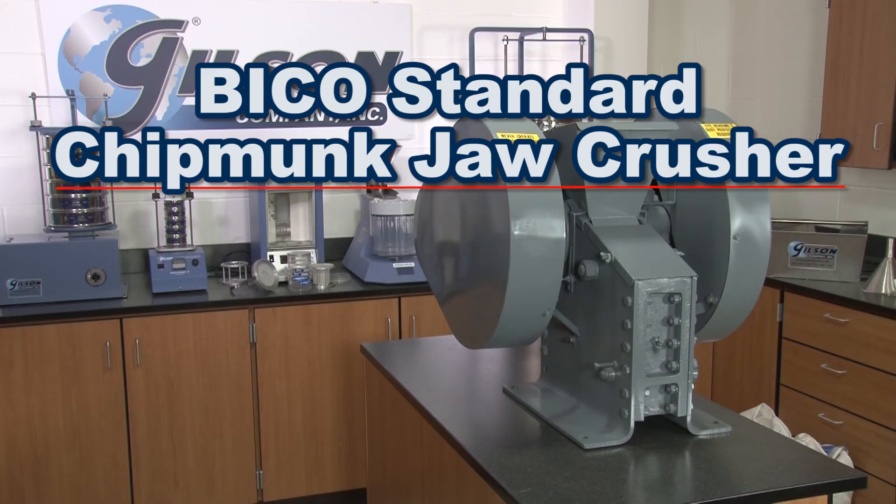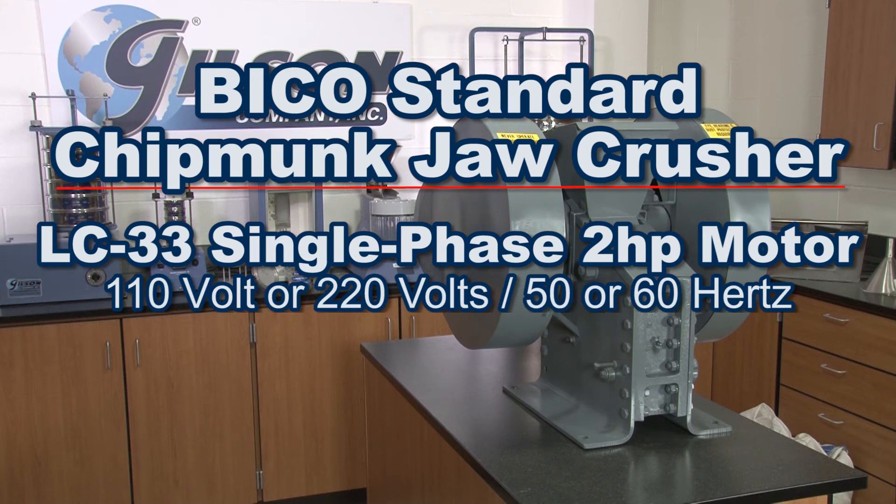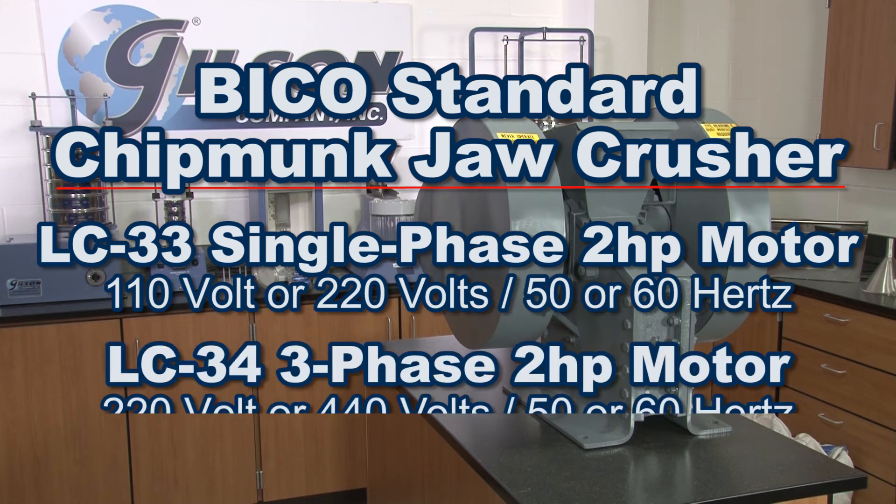Gilson offers two models to choose from. The Gilson LC-33 has a single phase motor, while the LC-34 has a three phase motor.